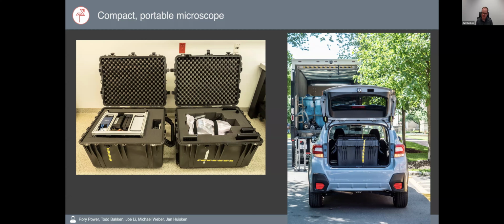Also, in terms of laser safety, that's all enclosed. So, of course, it's a home built system, so no guarantee. It's not like a commercial system. But yeah, this really has never been a problem.